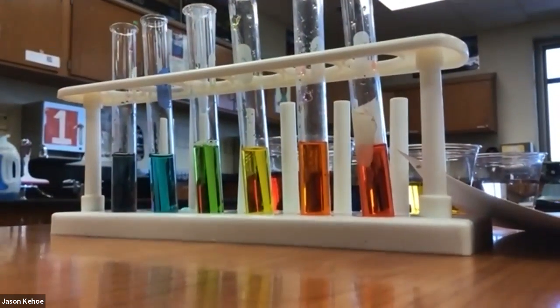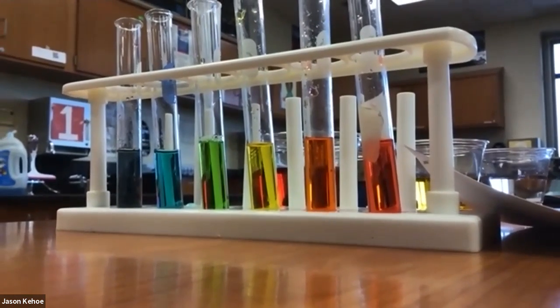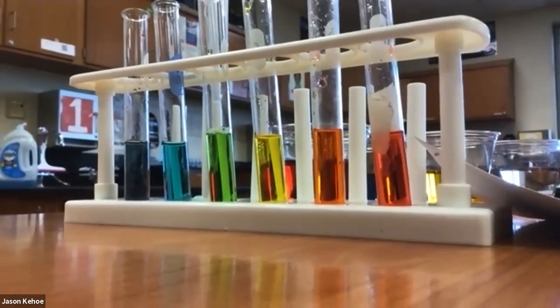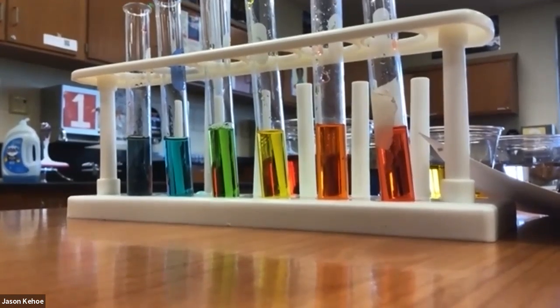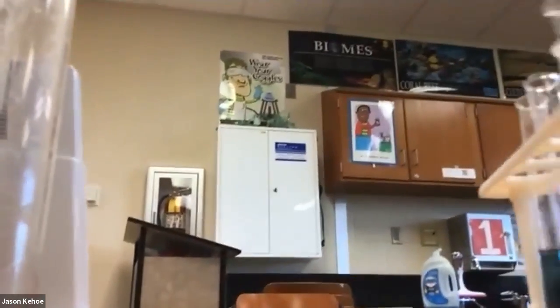All right, and look what we have here. Maybe I can turn this around so you can see it a little better. Isn't that lovely? So if you make your measurements accurately, it should end up being a rainbow, like Roy G. Biv, red, orange, yellow, green, blue, violet, in equal amounts. I did this really fast, so you can see a couple of them are a little bit higher than the others, but they're close enough for our purposes. Hopefully you don't have to rush like I did.